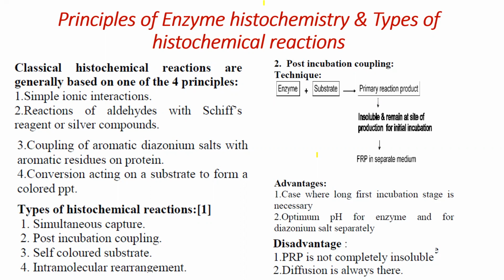Yes, Jasper. And also, usually students, we have these tough substrates only. The most commonly available substrates are not so friendly. We have seen that self-colored substrates and intramolecular rearrangement substrates are rare. Actually, by using them, we can do the test very fast.